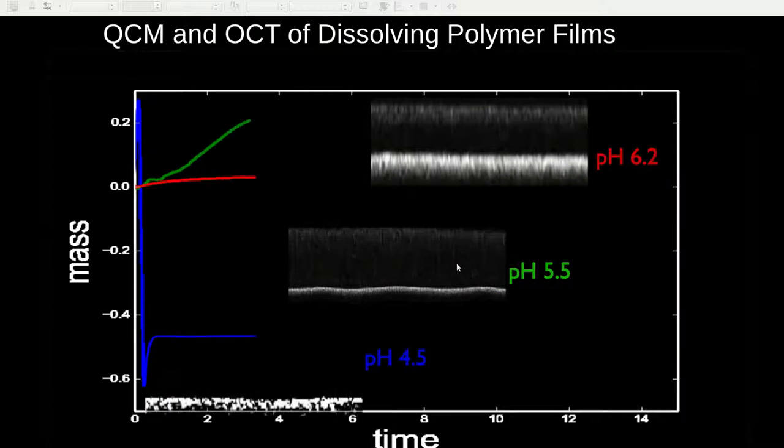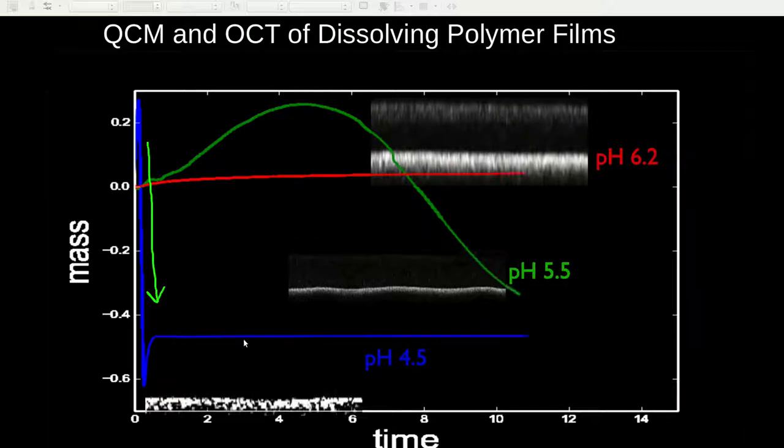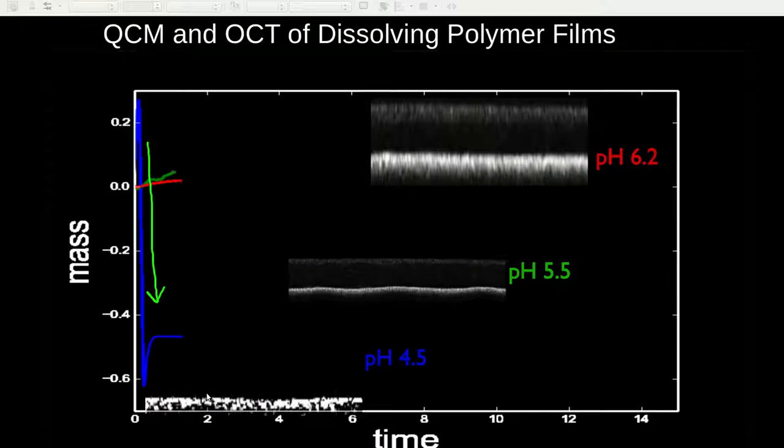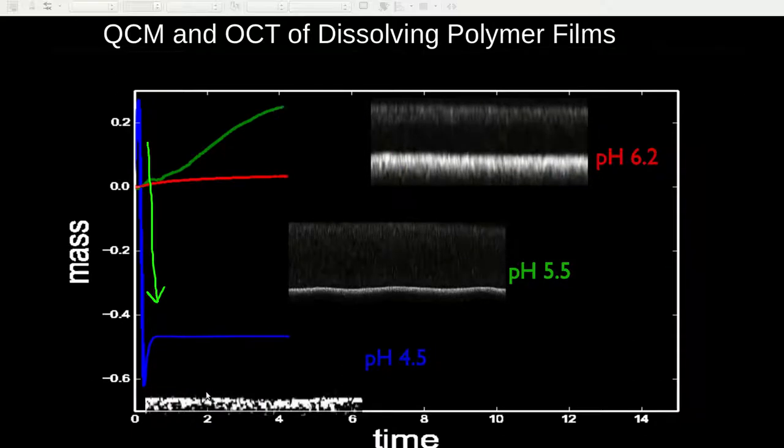Finally, at the lowest pH, we see that there is a very rapid decrease in mass as the polymer dissolves. This can also be seen at the beginning of the video which shows that the polymer film dissolves within the first minute or so of the experiment.